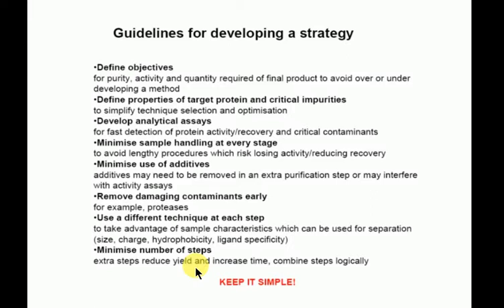The trouble you have there is what if those proteases are there for quality control purposes? So when you knock them out, you can now make an unfolded protein and the cell doesn't care. But if you have them in there, the cell does care, and all the protein you make will be active. So as soon as you knock out those quality control proteases thinking you'll get a better yield, well, you will, but it won't be as well folded and as active. So you have to keep that in consideration too.